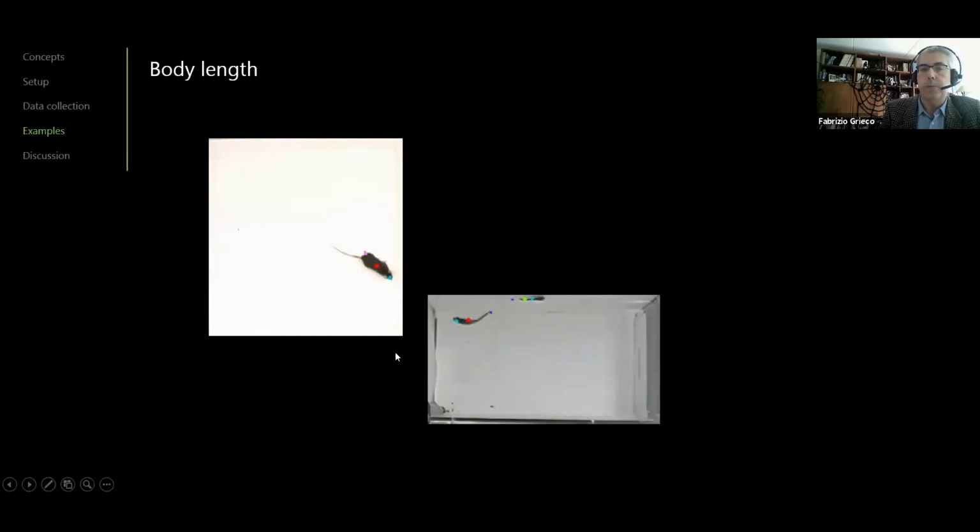We want to measure the extent of stretch behavior. Or in the case of this fish, you see that one is larger than the other. So it could be that I can use the length of this fish as a marker. Even though these two animals are not marked, I can individually mark them because I simply know the one is longer than the other one. So how do I get this body length from JavaScript?